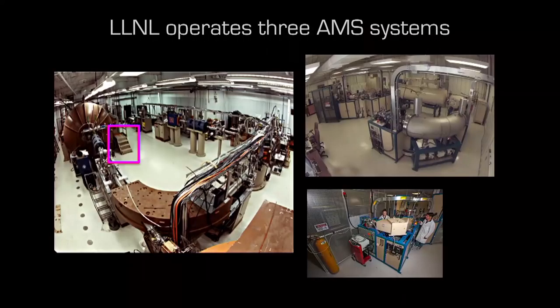And we actually have three instruments at the lab that we use for analysis. There's a very large instrument, which is the one there on the left-hand side. It takes up about a warehouse-sized room because it's very large. I've highlighted the steps there in that box to give you an idea of scale. It's the most powerful AMS that we have, and it's used to analyze a lot of different radioisotopes for a lot of different applications.